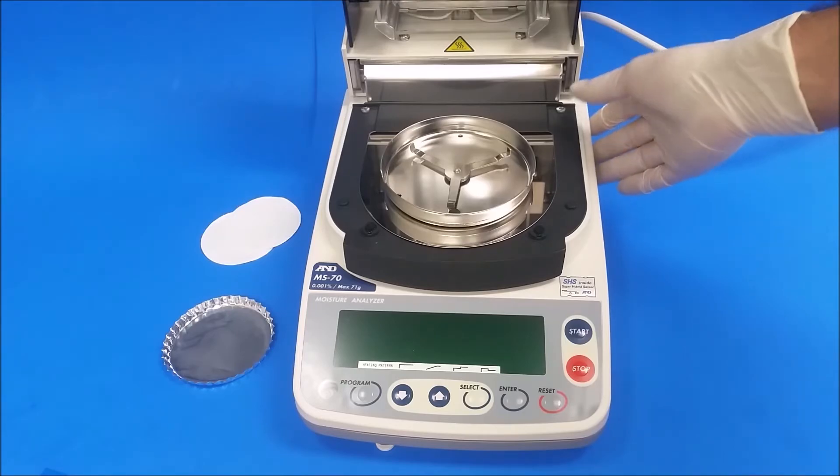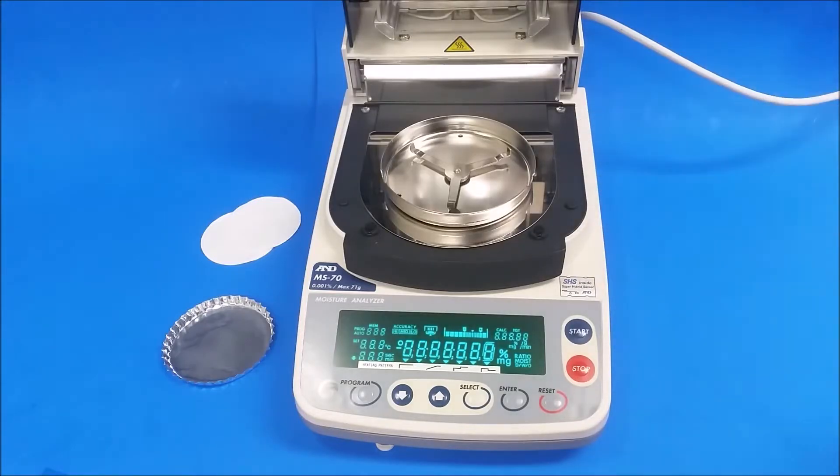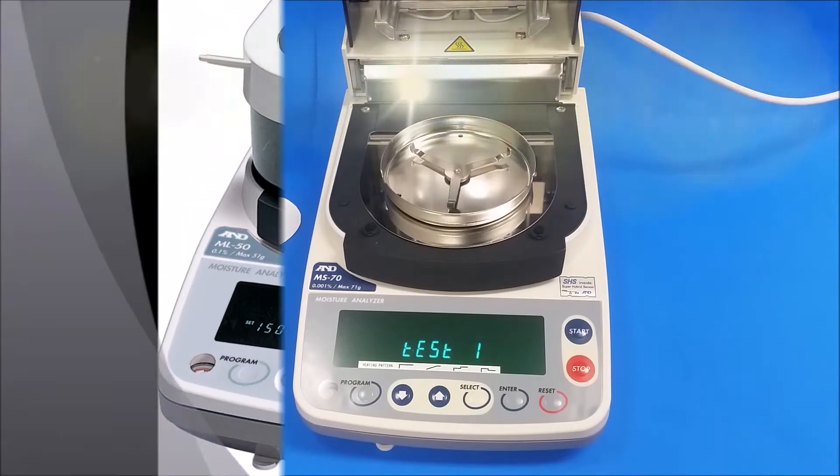We also have other AMD moisture analyzers that have the same steps as the MS-70: the MF 50, ML 50, and the MX 50.